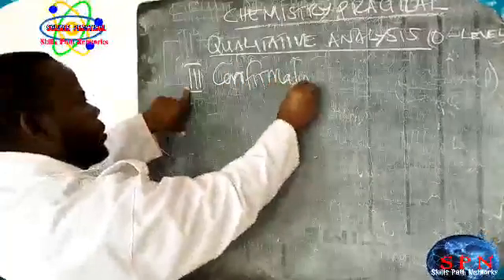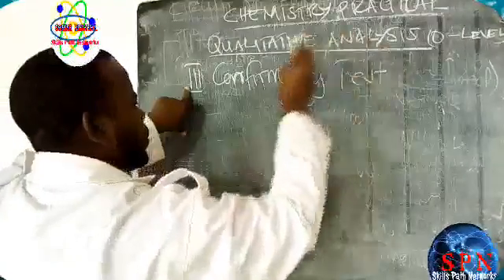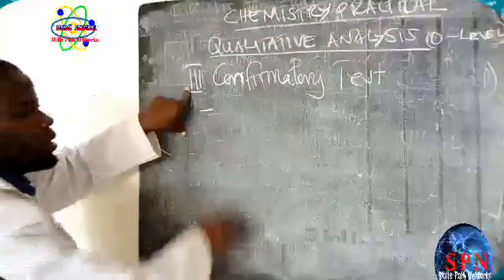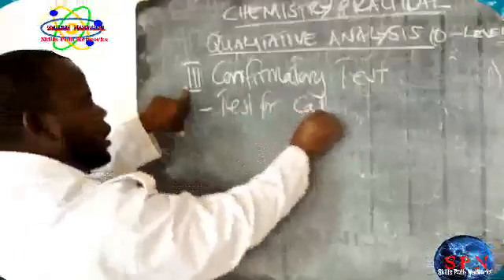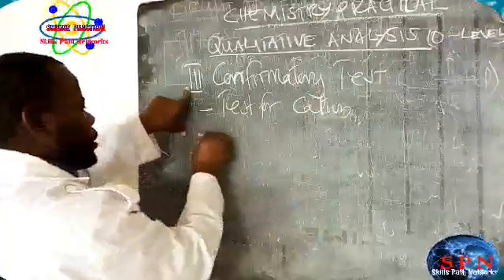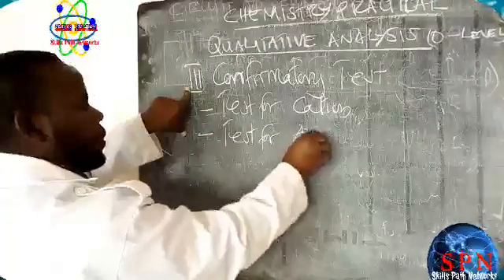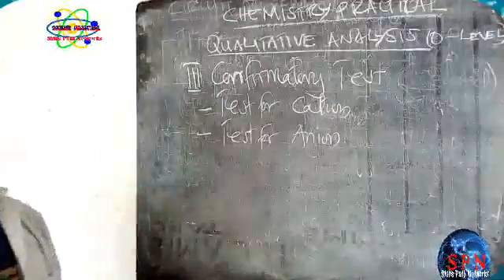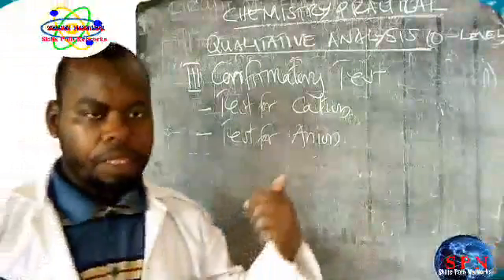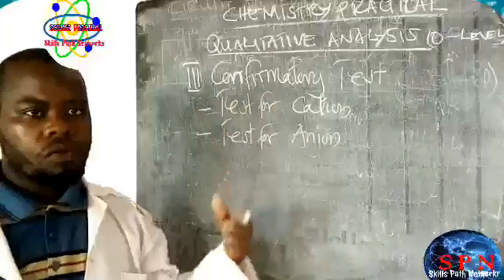Here we test for the cation and for the anion, with reference to the preliminary tests and tests in solution.